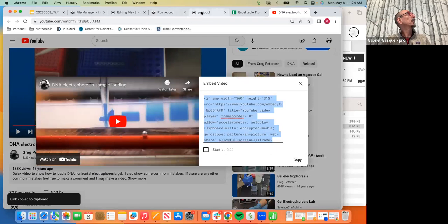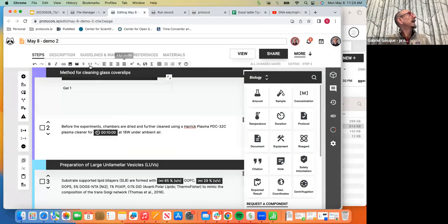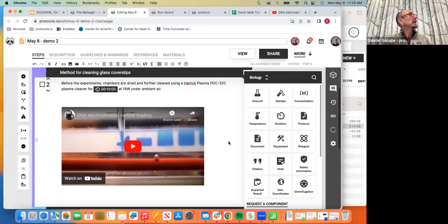I go back to my protocol, and I select here embed media. I can paste the code and save it. So now the video has been embedded. So I don't see the link. What I see is actually the video.